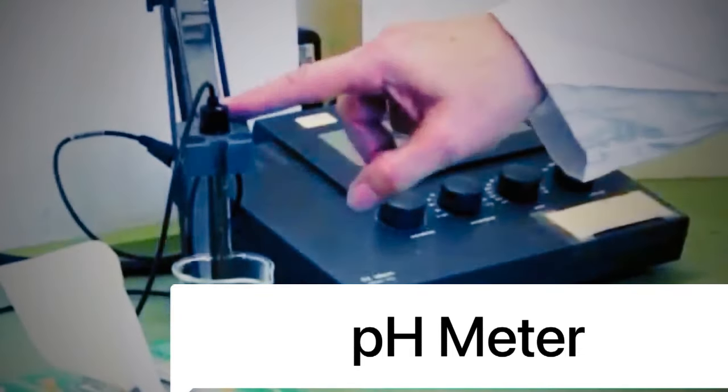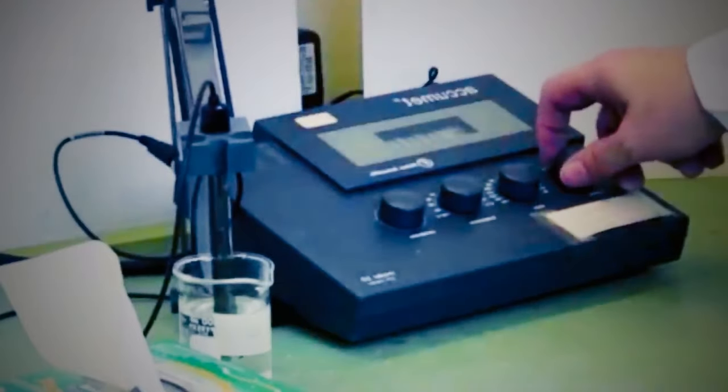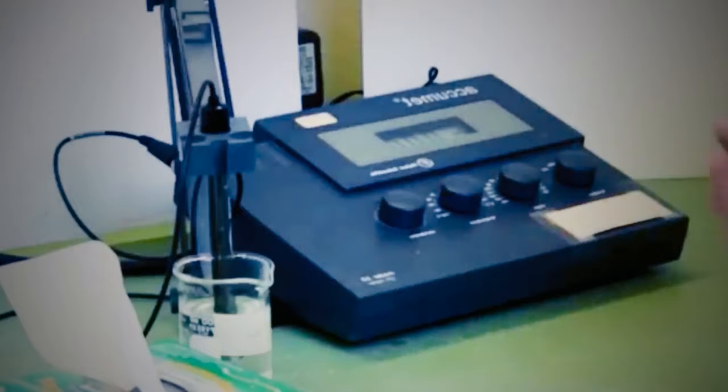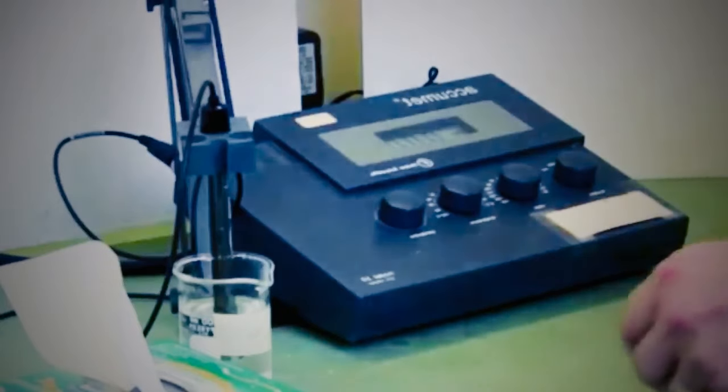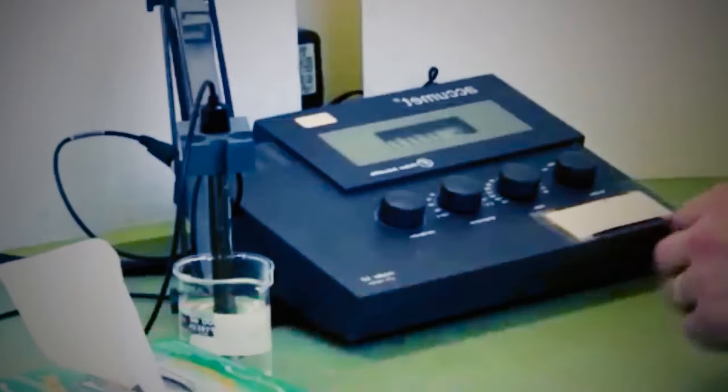pH meter. A simple and speedy device to measure the acidity and alkalinity of a fluid. A pH meter acts as a voltmeter that measures the electrical potential difference between a pH electrode and a reference electrode, and displays the result in terms of the pH value of the solution in which they are immersed.